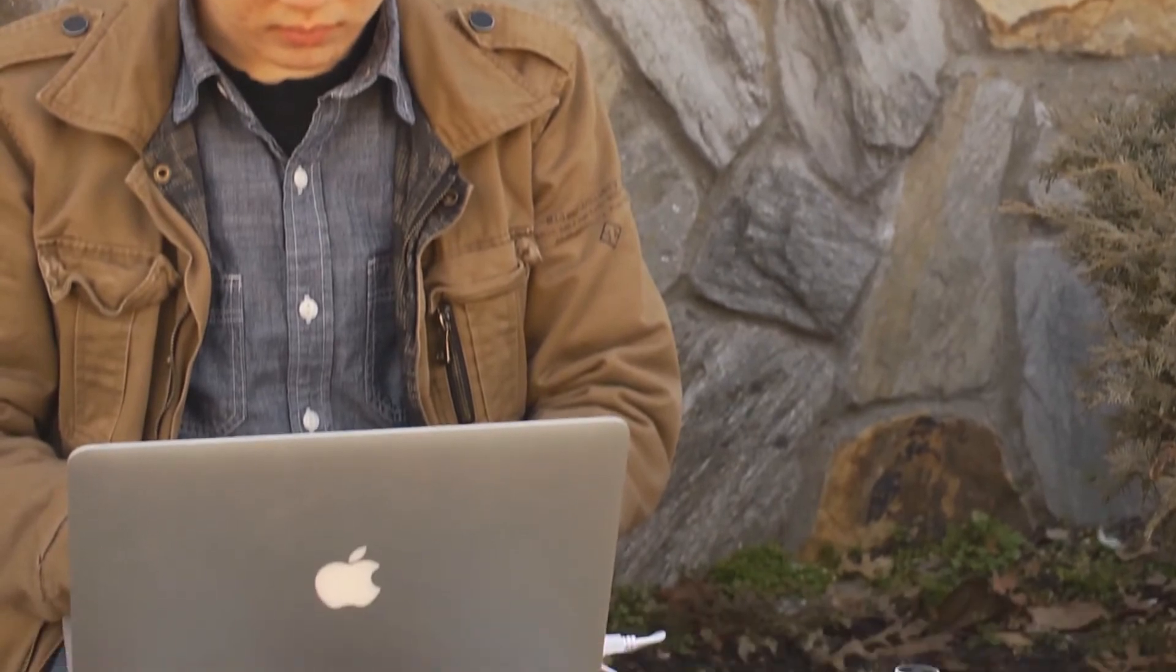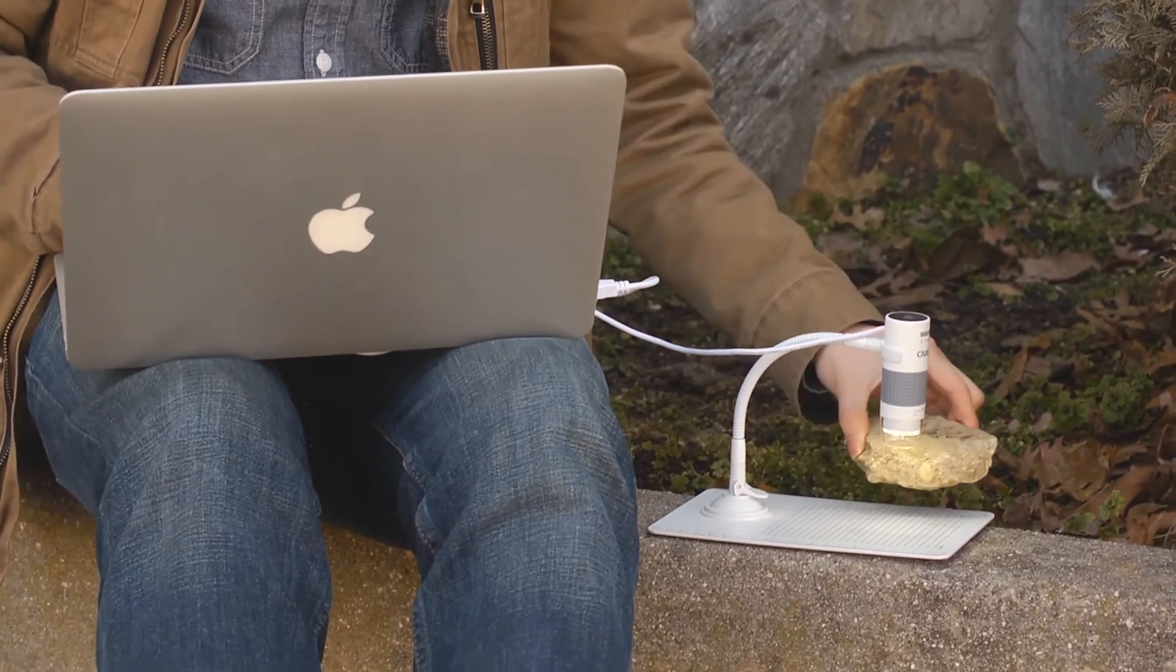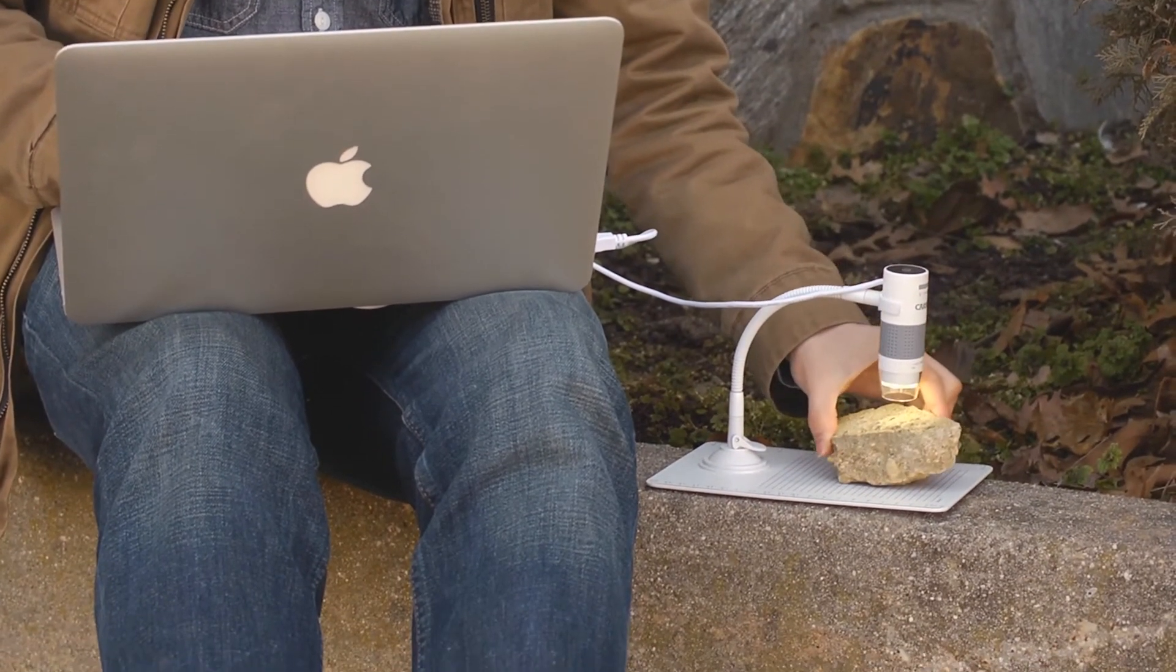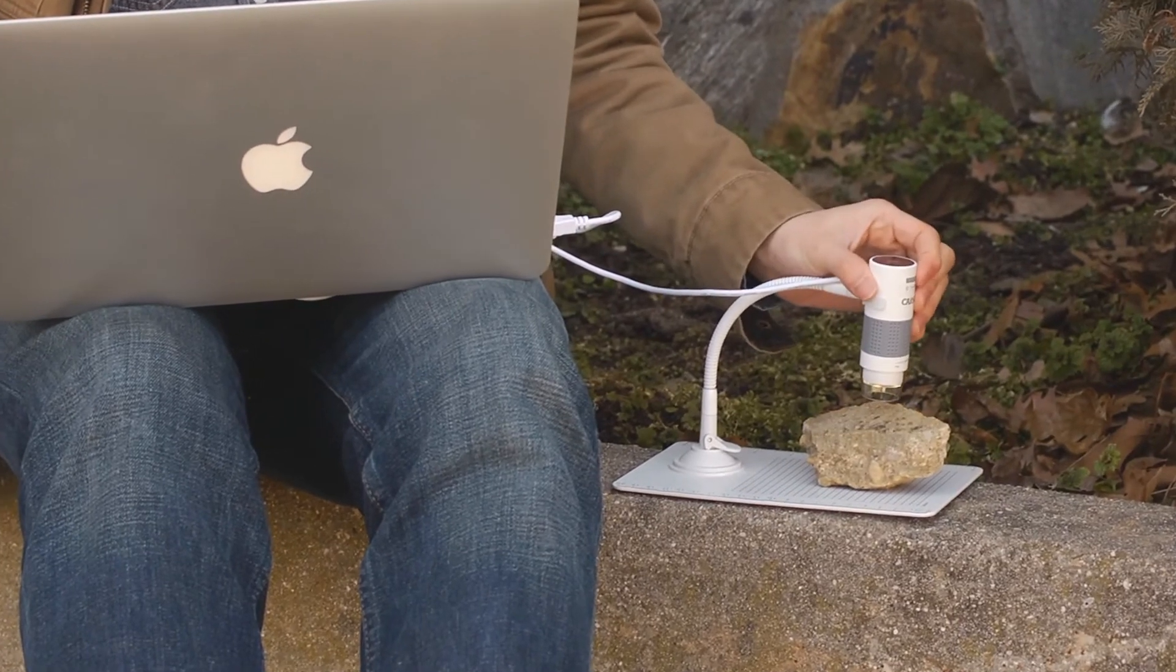If you plan on taking this item outside, sometimes there's no need for additional lighting. So that's awesome because you can actually turn them off.